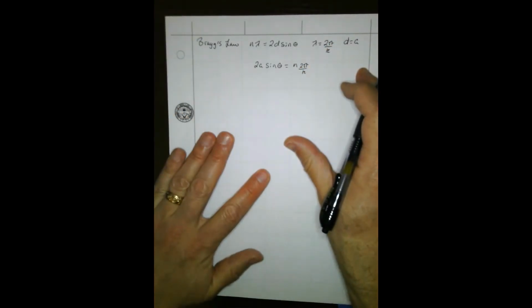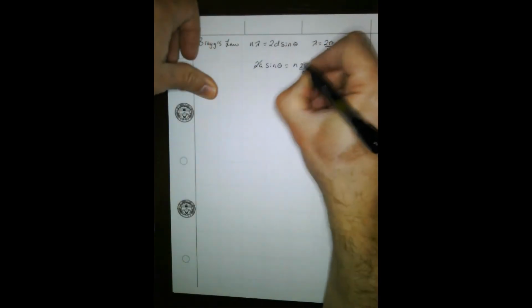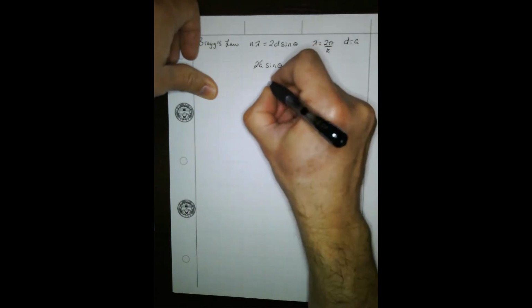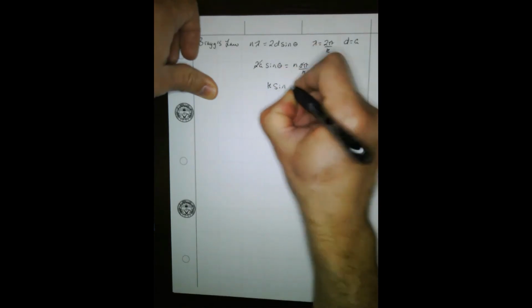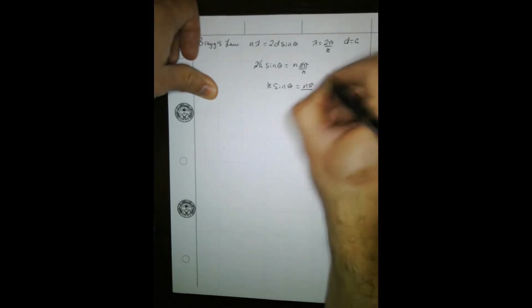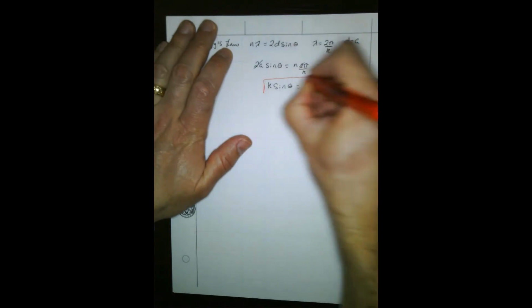So we get to a new form of Bragg's law. The 2's will cancel, and we can rewrite it as k sine theta equals n pi over a, where a is the lattice parameter and k is the k vector. This is an important equation.